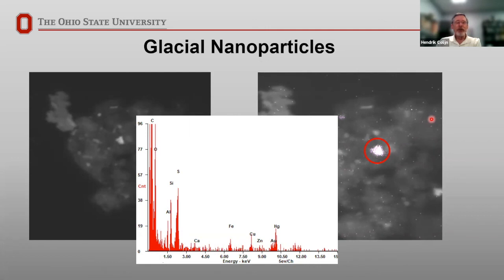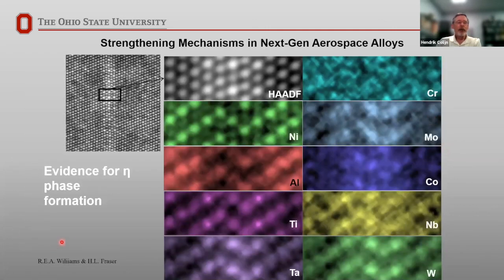Now, extending this even further, in our Titan microscopes, we can actually get to atomic resolution. And this is obviously something you can't quite get to in the SEM. So here is what's called a HAADF STEM image, a high resolution, high angle annular dark field image. And this little area here is shown in this EDX map. The signals that were collected show all these different elements in this particular alloy.